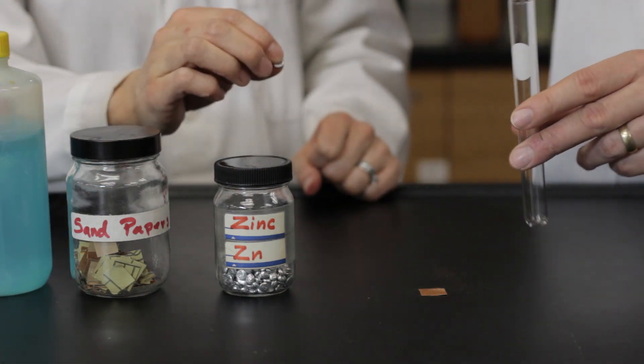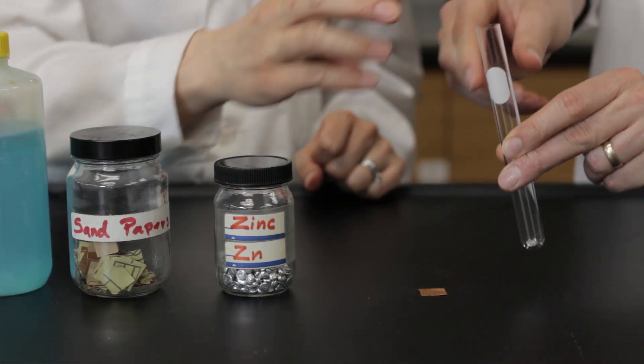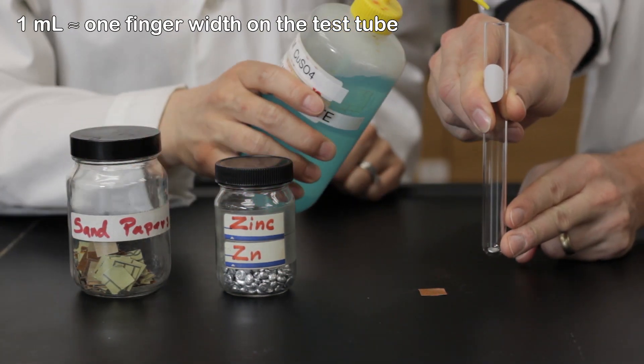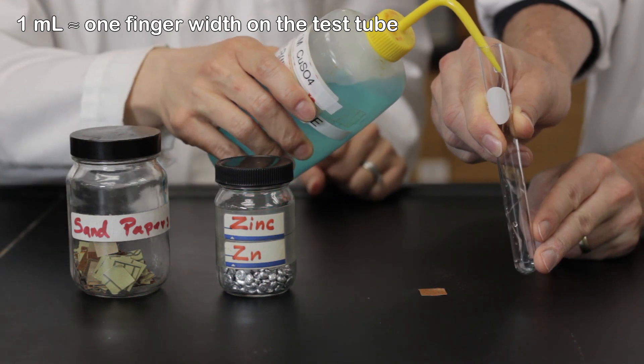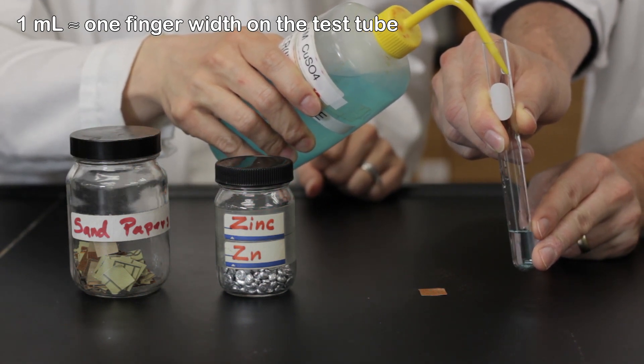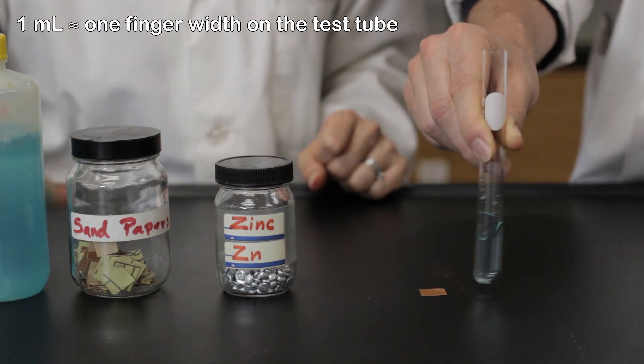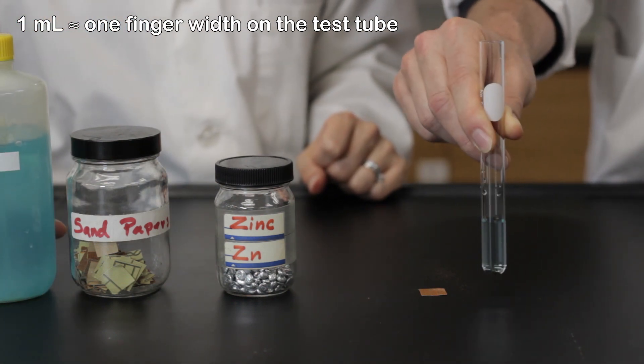For single replacement reactions, in the test tube, mix 2 milliliters of solution with a strip of metal. There's no need to use a graduated cylinder, you only need approximate volumes. Instead, 1 milliliter is about 1 finger width on the test tube.